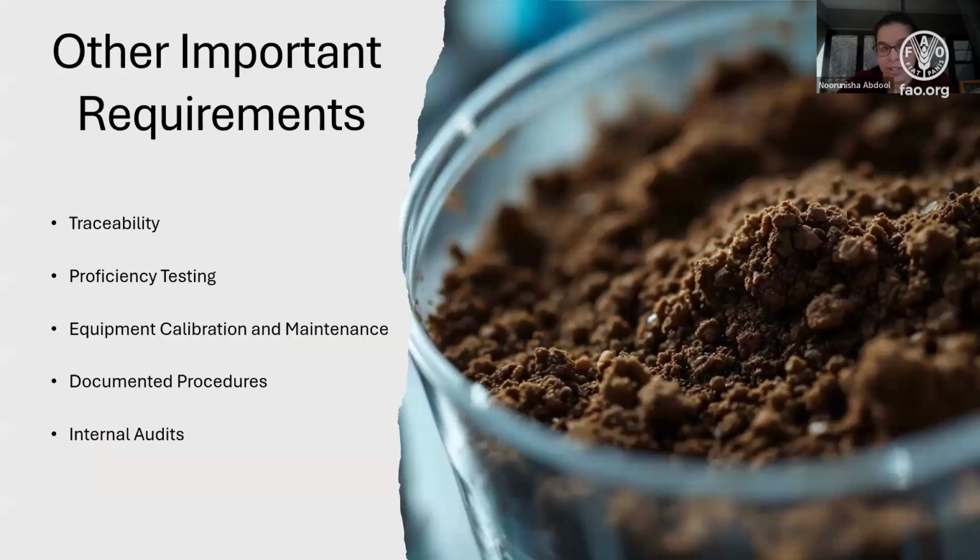But before we get there, I'm going to touch on a few things that Joseph mentioned in his presentation. In order for you to have your method validation, it's very important that you have these documents as well, or these processes involved. Traceability means, do you have your COAs? Can your suppliers supply you with COAs? And that's not just for your CRMs, but for your reagents. With your water in your laboratory, do you check that all the time? Have you checked the pH? Have you checked the EC? Is it interfering with the actual analysis that you're doing?